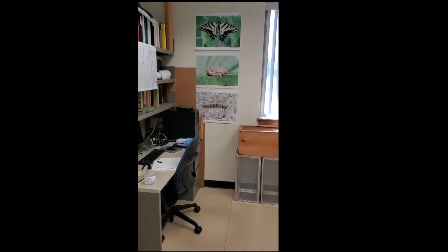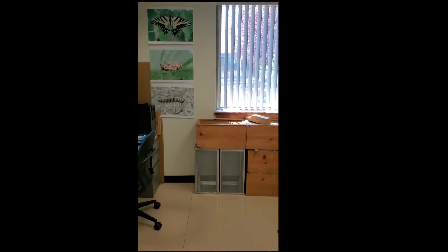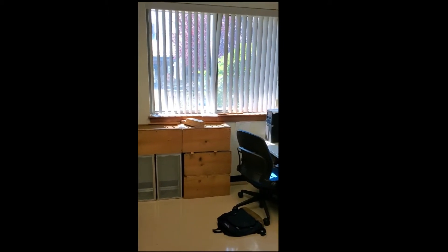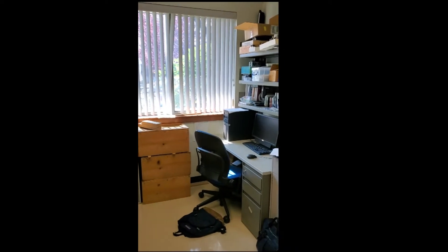This is what we call our rearing room. We get live insects in sometimes and sometimes they're in a larval or immature form like caterpillars. And we actually have to wait till they turn into an adult like a butterfly to be able to identify them.